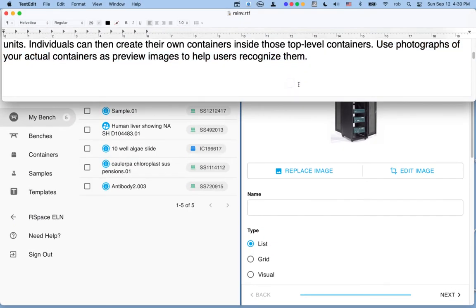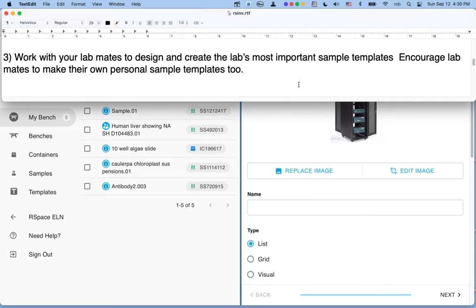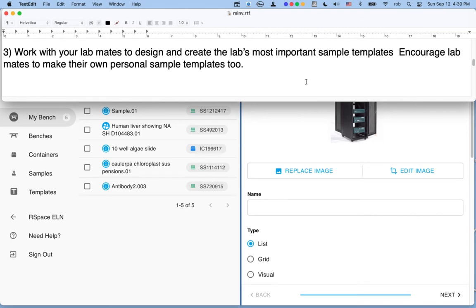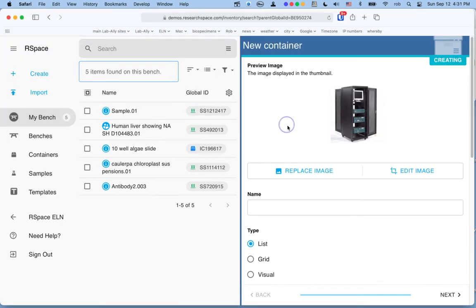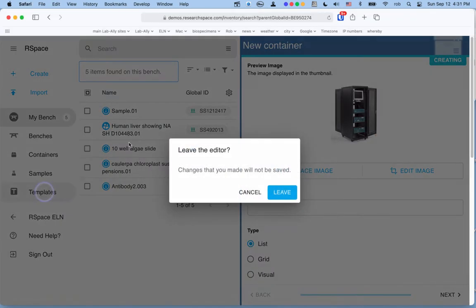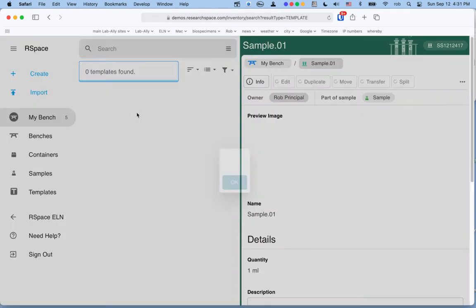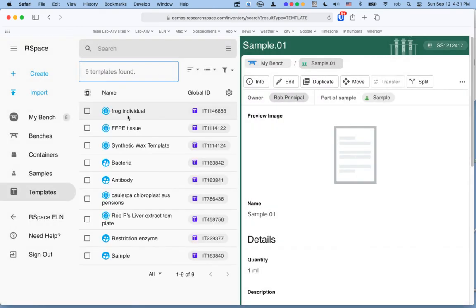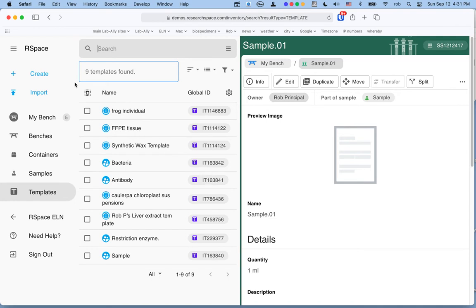Once you've made your top-level containers, your next step is to go ahead and work with your lab mates to design and create your most important sample templates. Sample templates in RSpace look like this, and they're what you use to create your samples. Sample templates can be easily edited, but they must be made initially from an existing sample, at least currently. So if you don't already know exactly what your sample will look like, what we typically would recommend is you'll go to the Create menu and you'll say Make a New Sample.